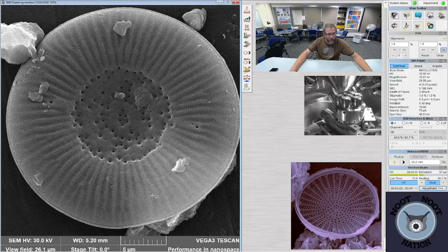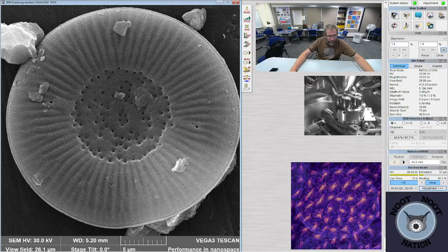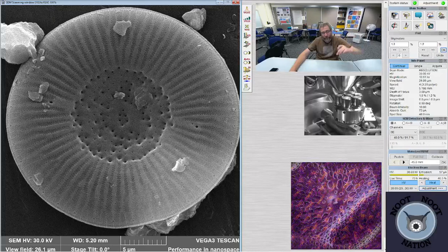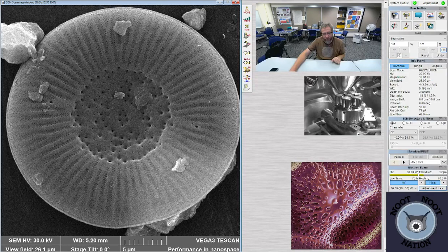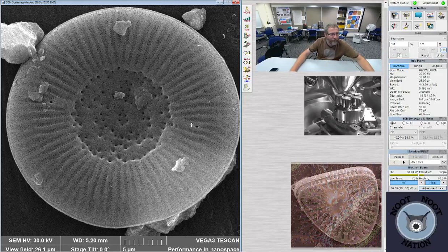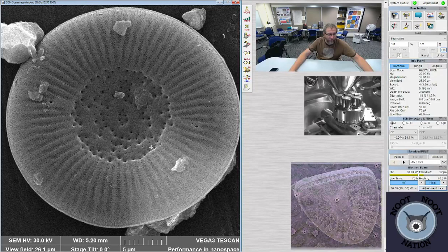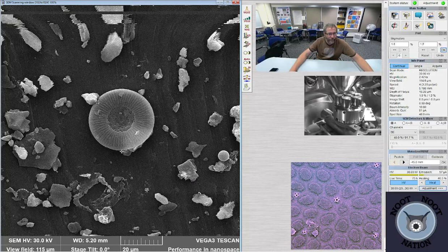So you can see all kinds of detail you wouldn't normally be able to see. Also, you'll note down here, there's a little bit of a white area around the valve, like in here, where it's lighter and it's darker around here. It's because the electron beam is actually going all the way through the diatom skeleton right here, the cell wall. And you're seeing this thing behind it, which is a piece of silt. You're actually seeing through the diatom. It's lightly enough silicified, and the beam is set to a 30 kilovolt accelerator voltage, actually seeing through the diatom a little bit, which is cool. Except for when you don't want to see through it, I guess.